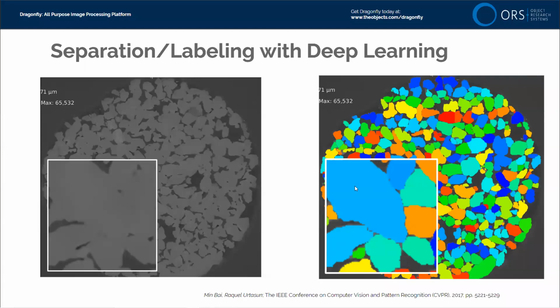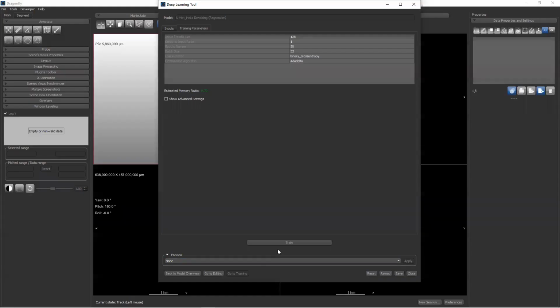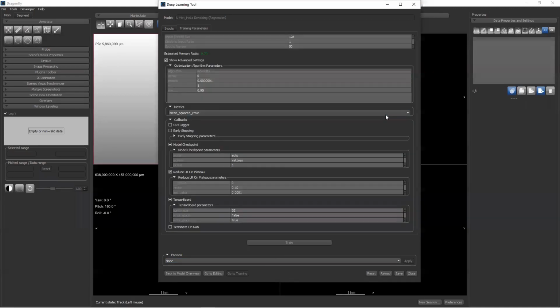Next question. Please go through the parameters used to determine early stopping. Benjamin, if I pull up that panel now, I'm going to unmute you. I think I can unmute you. Maybe I can't. I'm going to go to that panel, and you can tell me if you want to answer that. I don't think we have Benjamin on the line anymore.